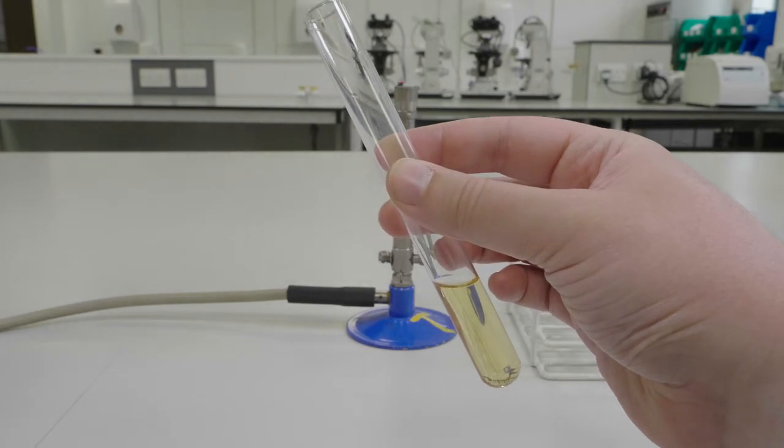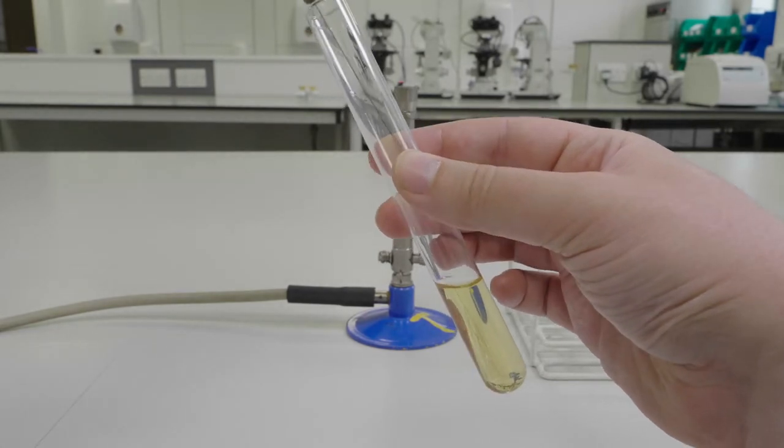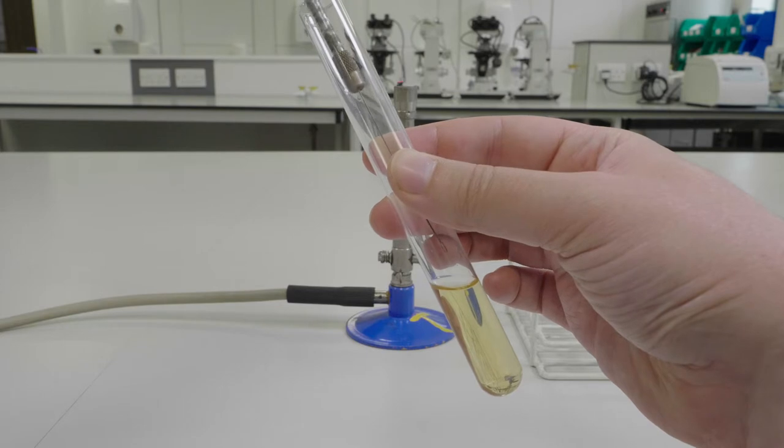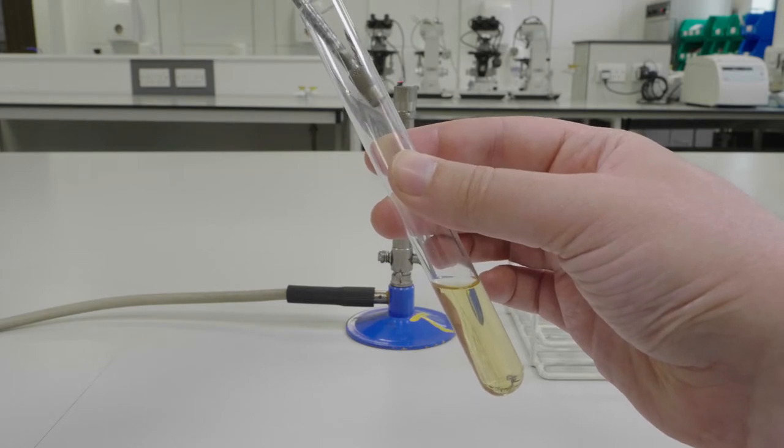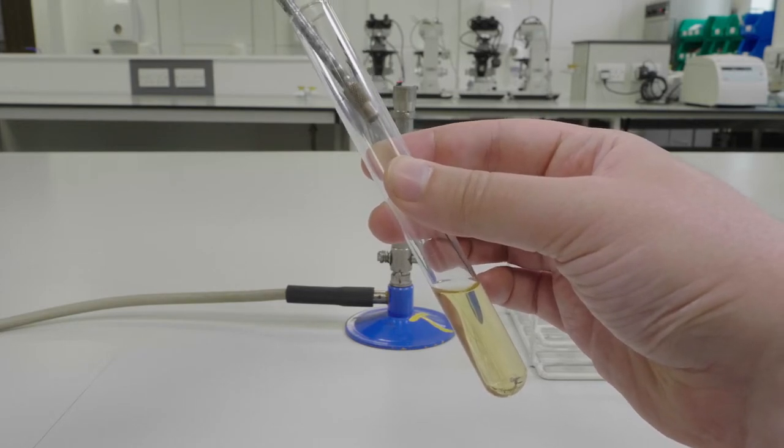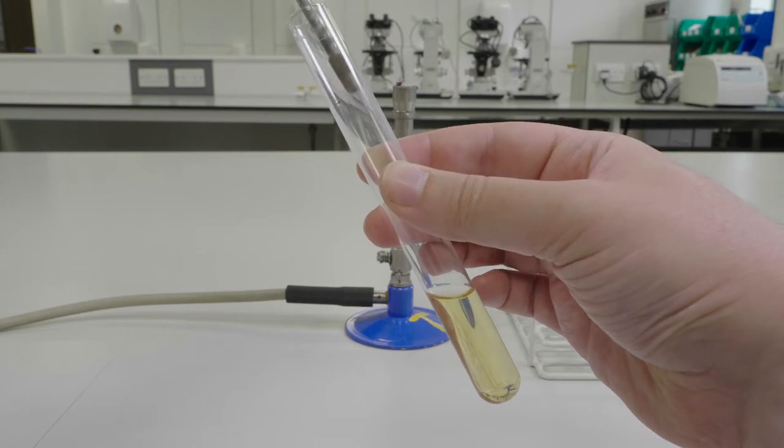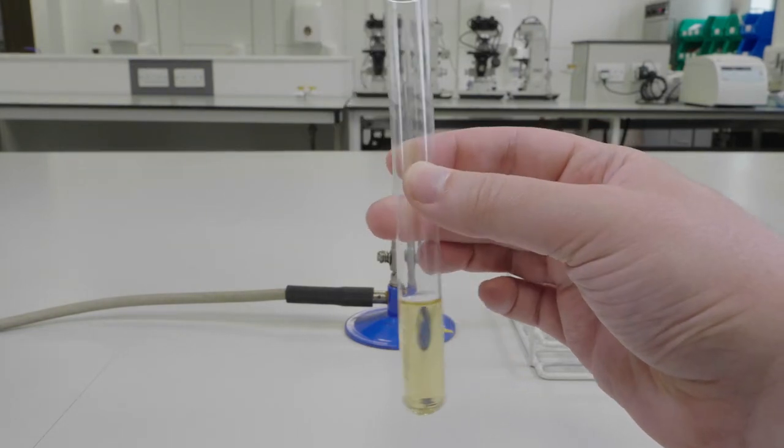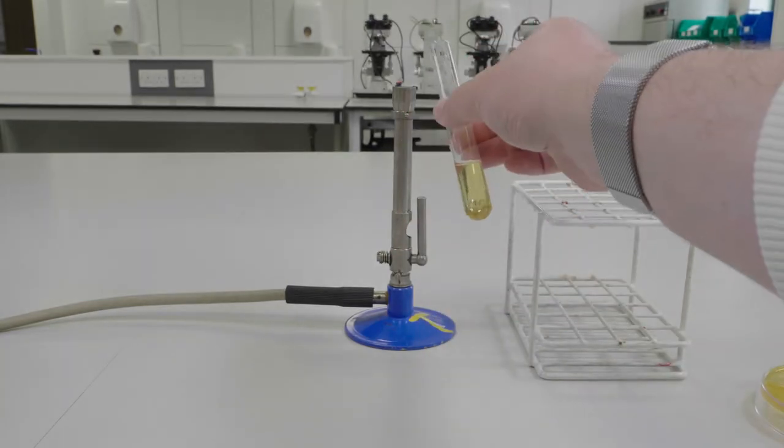Then tip the test tube to one side, hold your inoculating loop like a paintbrush, insert it into the test tube and rub your sample of bacteria against the glass of the tube. You should aim for the part of the tube which is under the level of the culture medium when the tube is returned to vertical.